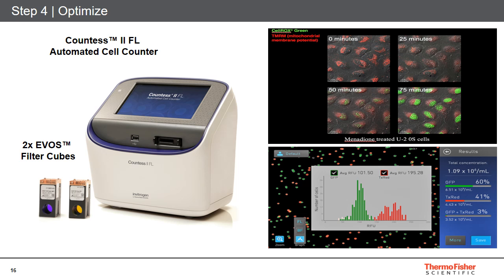Now, these types of experiments, as I mentioned, can be rather time-consuming to not only set up but also acquire, and can involve quite a bit of setup and optimization and troubleshooting. So a really easy and elegant approach towards speeding some of this work up on the front end is to use a slightly simpler approach where we're not necessarily doing time-lapse imaging and setting up these continuous multi-hour, potentially overnight time lapses and trying over and over again.